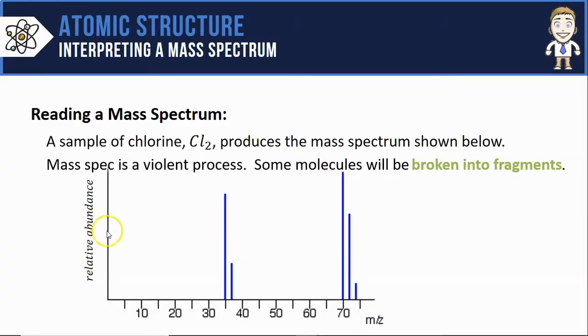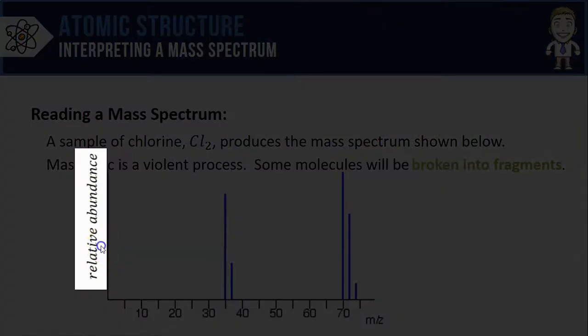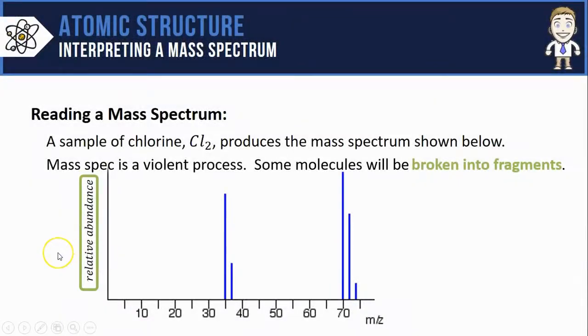The last thing to notice in this spectrum and some others that you'll see is the vertical axis is not percent abundance, instead it's labeled relative abundance. All that means is that the peak height indicates relative comparisons in amount, not actual percentages.